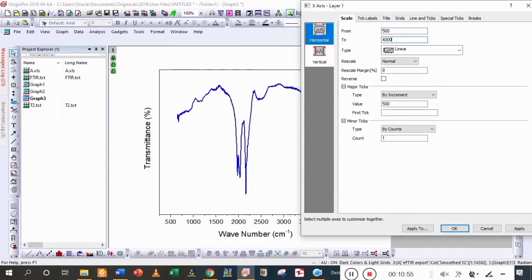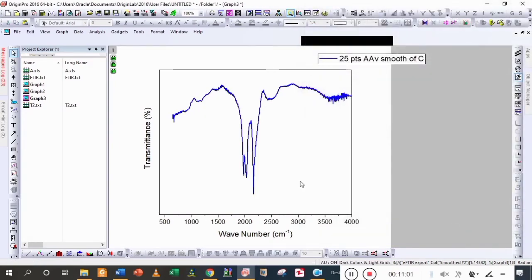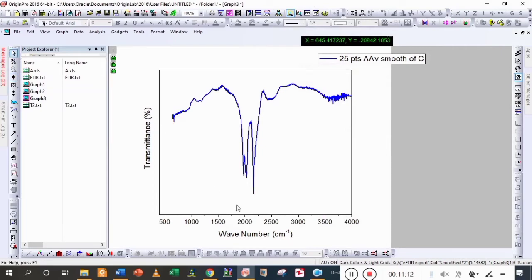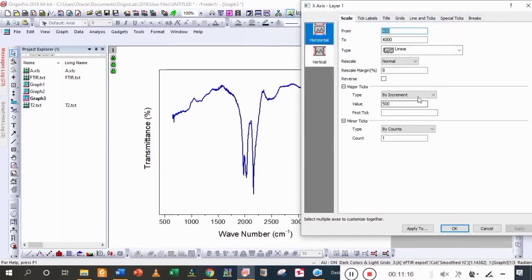Mostly we use the graph from 400 to 4000, but here our data starts from 650, so we are going to change it. You can see that the graph is starting from 645, so we are going to change the scale from 600 to 4000.